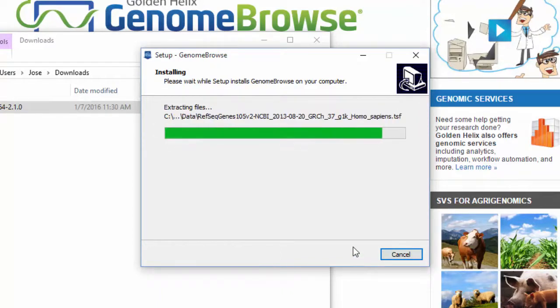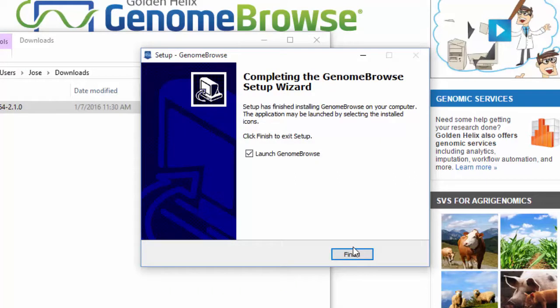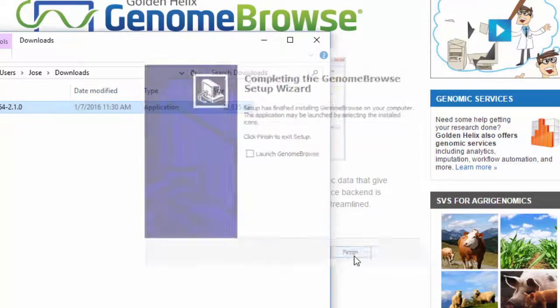When the installation is complete, uncheck the box to launch Genome Browse, and then click Finish.